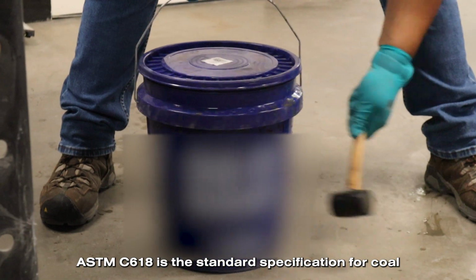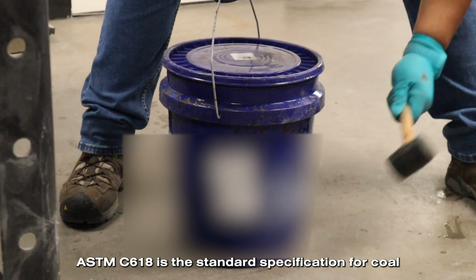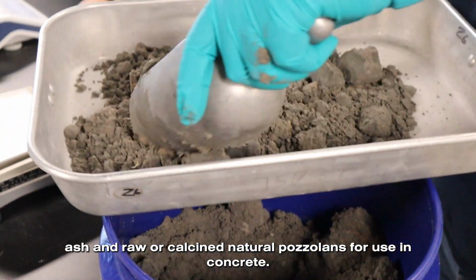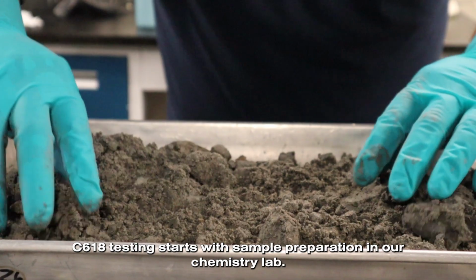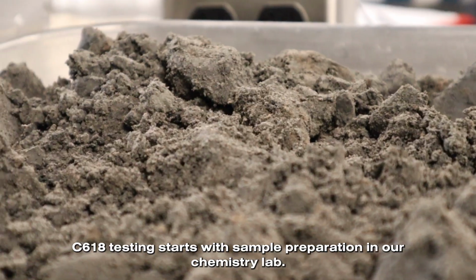ASTM C618 is the standard specification for coal ash and raw or calcined natural pozzolans for use in concrete. C618 testing starts with sample preparation in our chemistry lab.